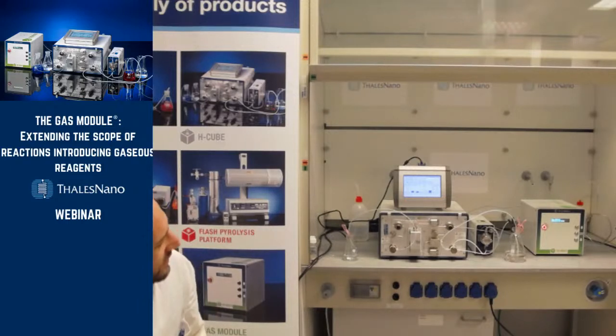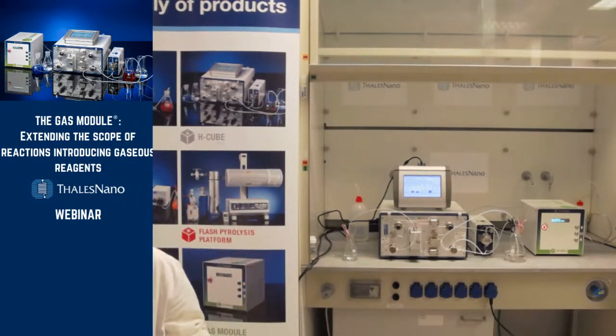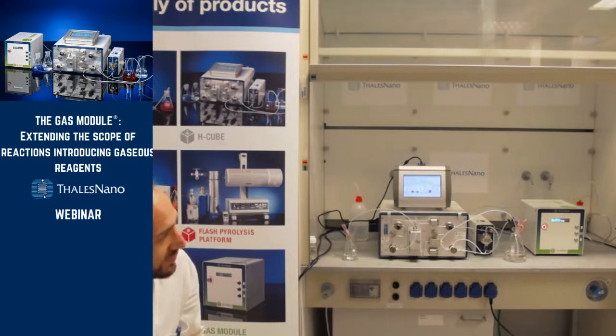Something I can add: you saw the setup with the gas module and the H-Cube right now. But I mentioned you can also do this, and you saw some examples of chemistry done, on the Phoenix and gas module.